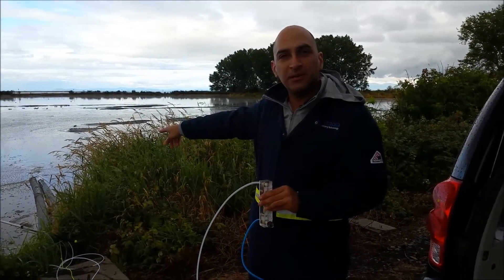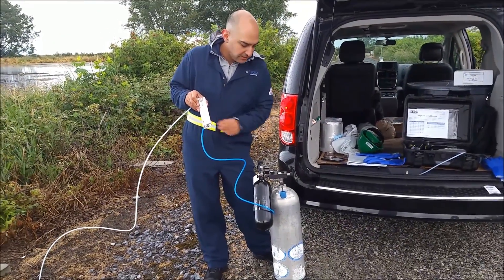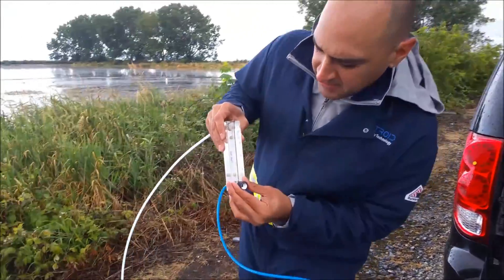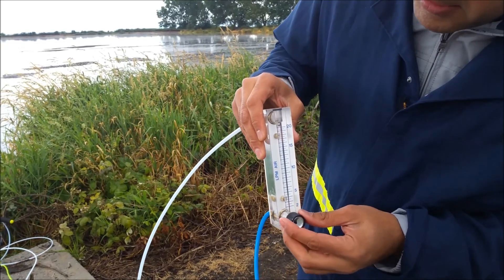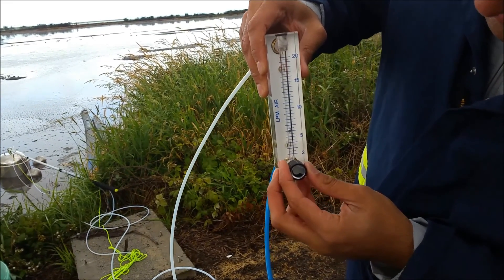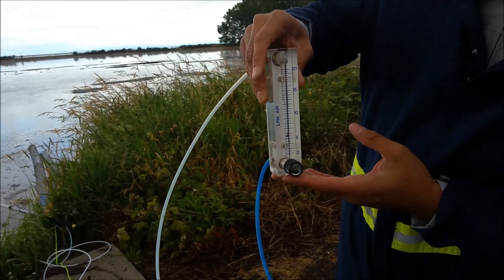Now that we've got the flux chamber launched and it's sitting in position, it's time to flush it. I have a flow meter here and I'm going to turn on the air and start the flow. I want exactly 6.5 liters per minute — around that. The flow rate is important so it should be quite accurate.